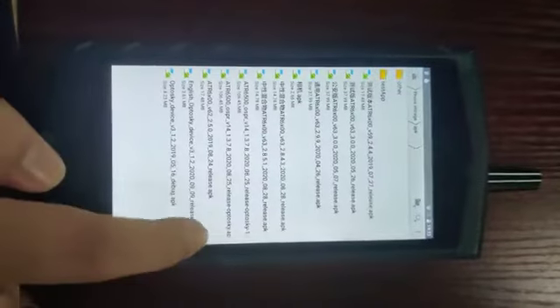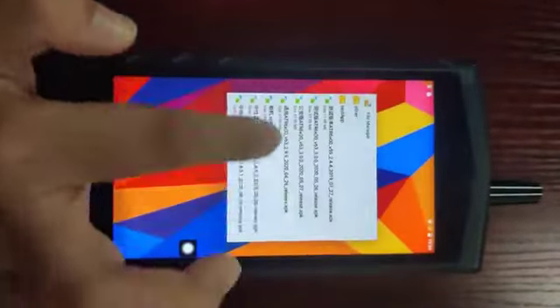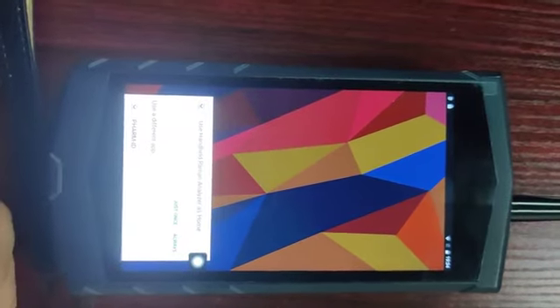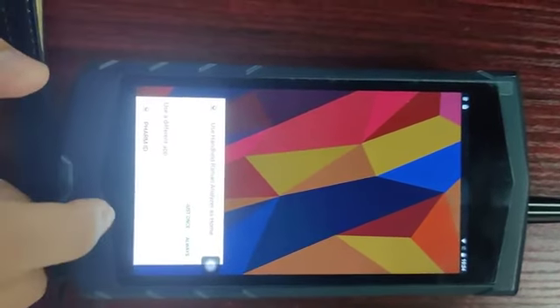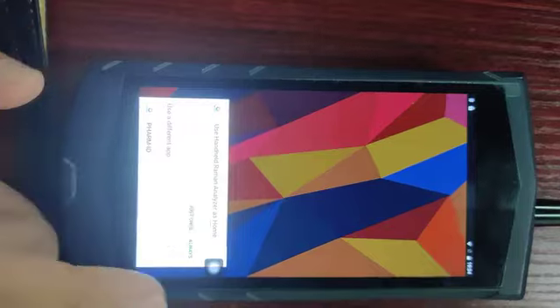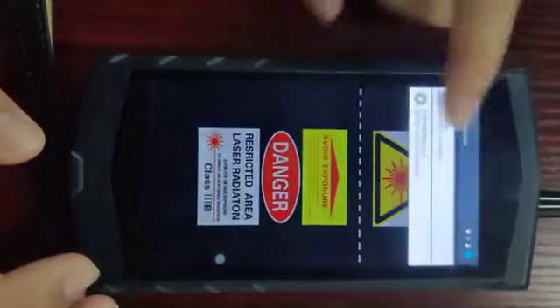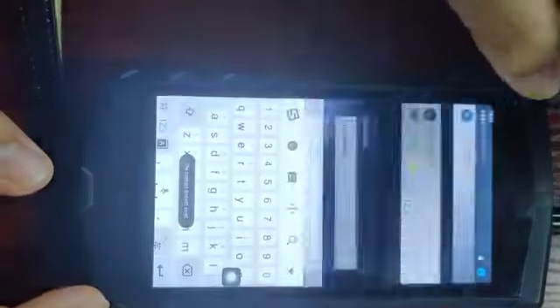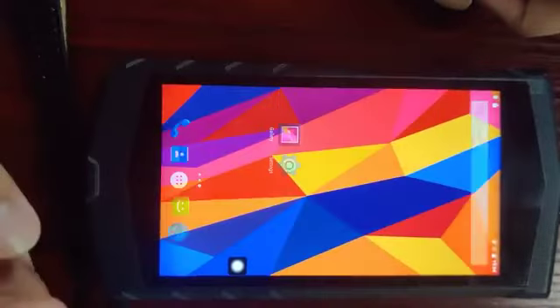Done. After installation of the library app and handheld Raman, a prompt sometimes pops up. Use the handheld Raman analyzer. Just click once, and slide down again to click setup. Click launcher again to return to the background.